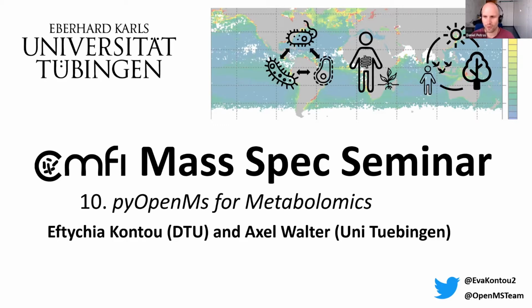So particularly, I guess, for high throughput applications, core facilities, or power users with a lot of projects going on, I think this can be super useful.